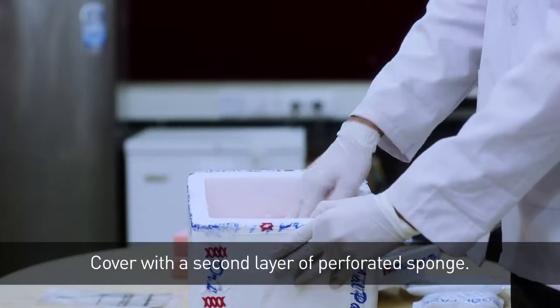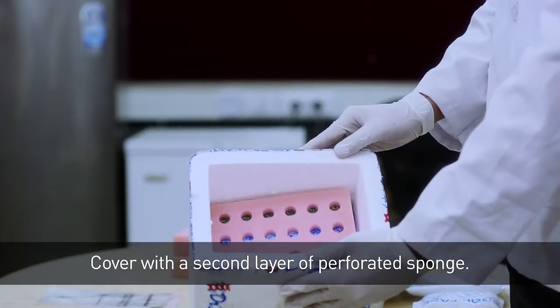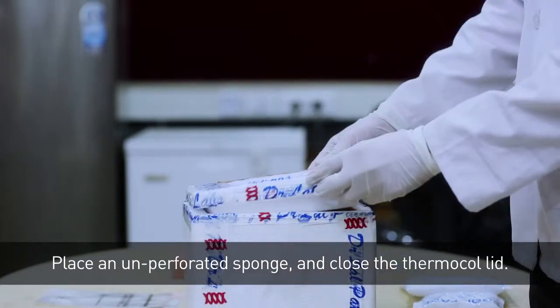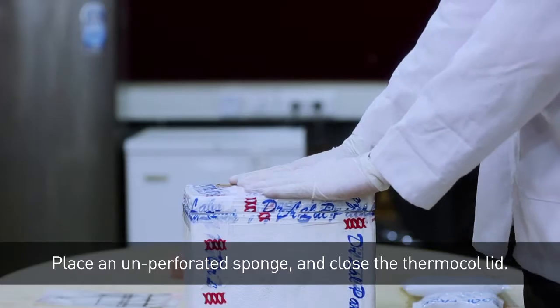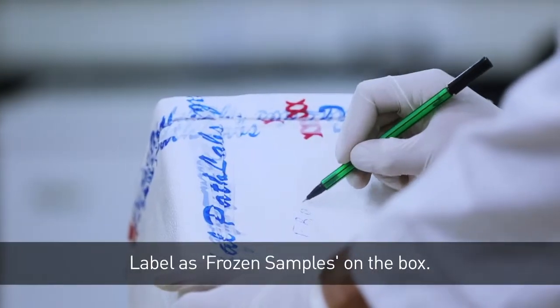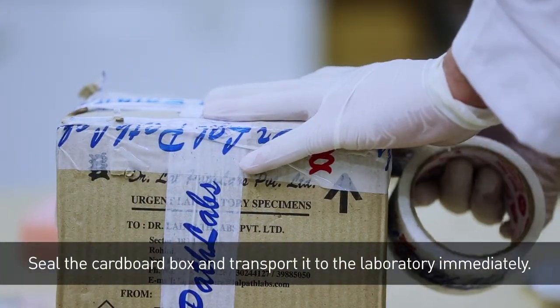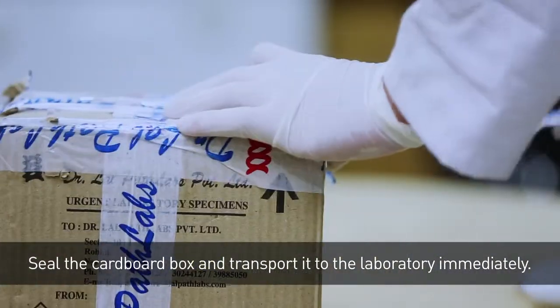Cover with a second layer of perforated sponge. Place an unperforated sponge and close the thermacol lid. Label as frozen samples on the box. Seal the cardboard box and transport it to the laboratory immediately.